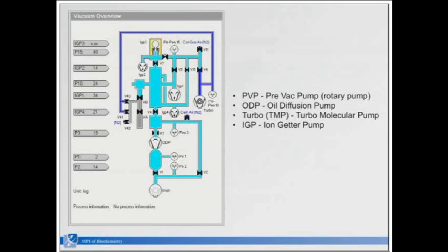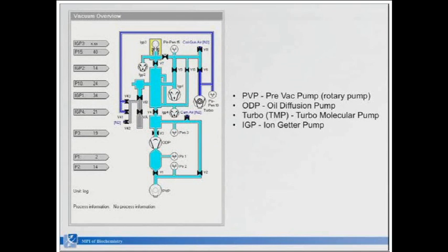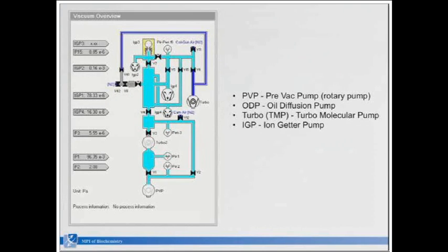So after 7 days, for example, with the Polara, you heat up the system to get every potential contaminant out of the microscope. What you have seen here is the typical log scale of FEI. You can remember that log scale, or you can just adapt it to the millibar or Pascal level, where you can see that you operate a microscope at the column level at 10 to the minus 6 millibars, whereas at the camera level it's not that good, normally never.